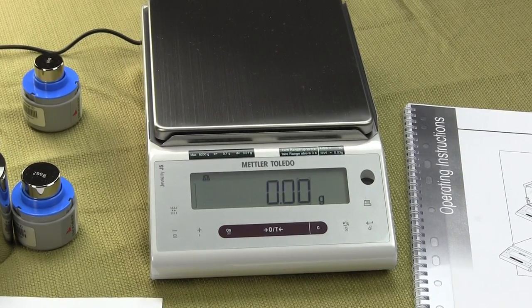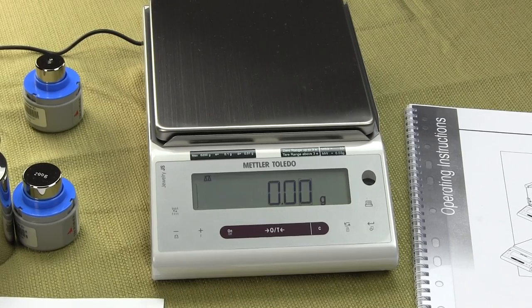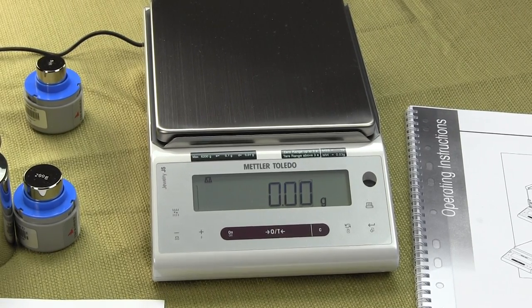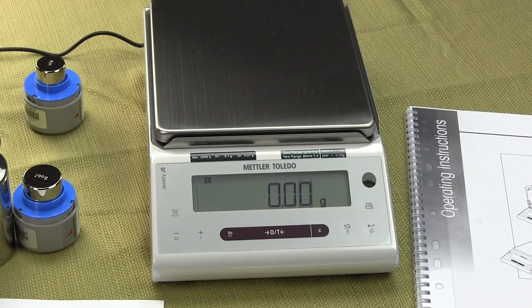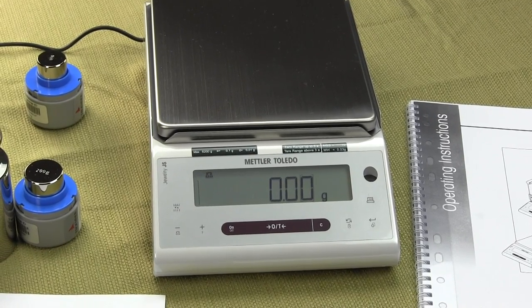Welcome to Precision. Today we're going to show you the Mettler Toledo. This is the new JS series. This is a JS6002G Slash A.